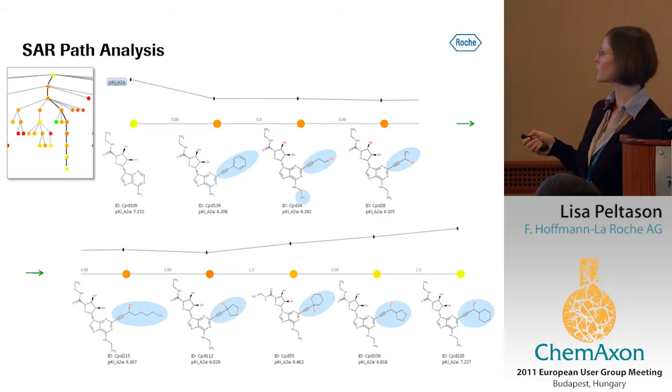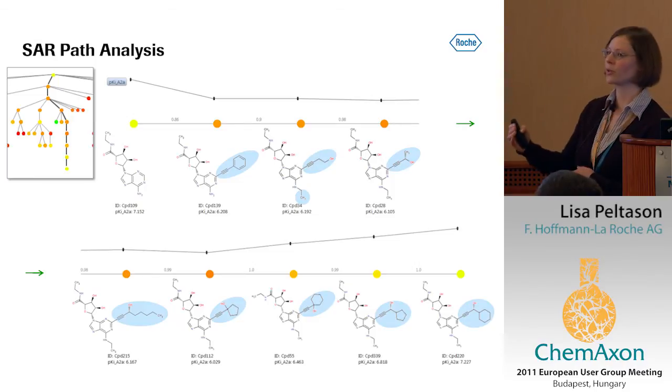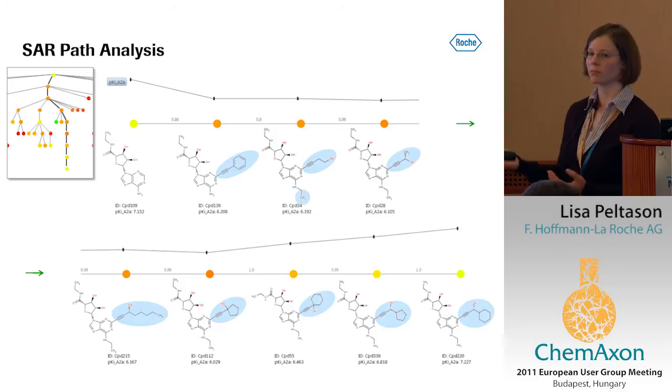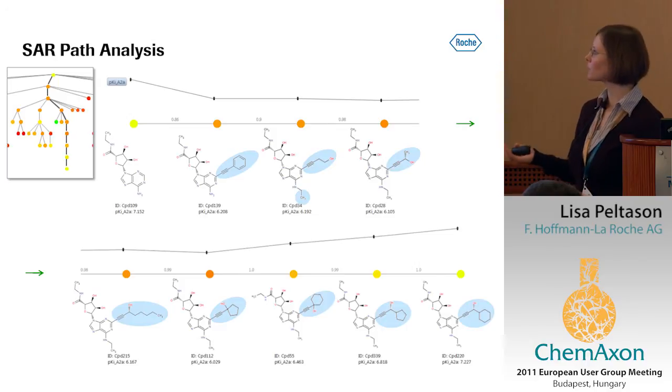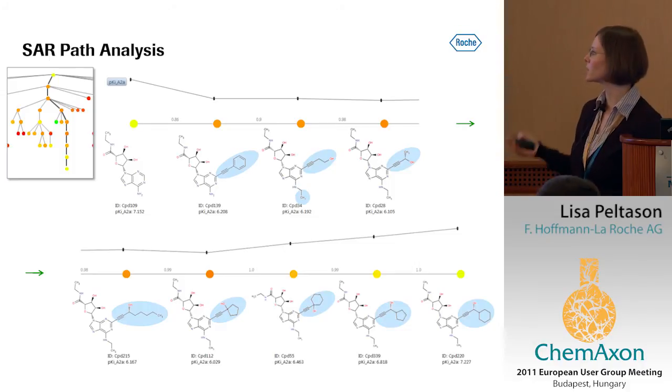And we can see here that actually modifications have mostly taken place at this point, and in those first 5 molecules, activity basically stays the same. However, when we move on, we can see here at least a slight increase in potency, which of course is now really interesting to relate to the modifications that have been made. And for the scientists, this is really the way how to directly relate the modifications that have been made to their potency or to the effects that these modifications had.